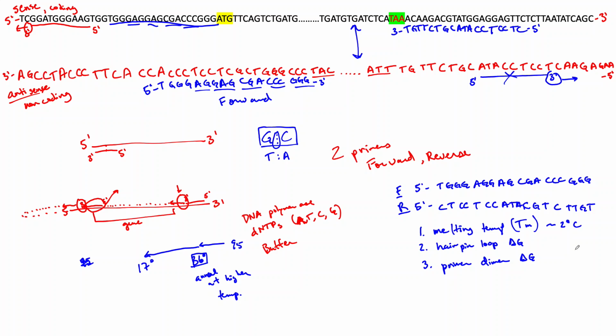The other thing you want to make sure of is that these primers are going to want to anneal. Want is a weird word for an inanimate object here, right? But you want to make sure that these primers are more likely to anneal to the template DNA than they are to themselves or each other.